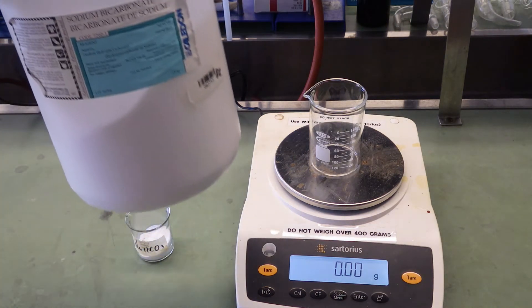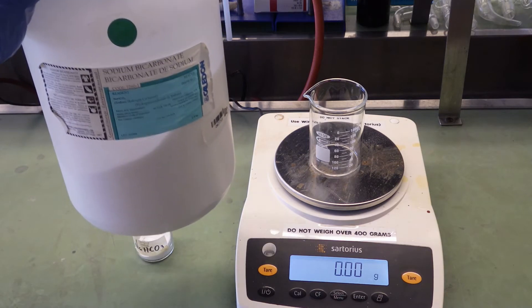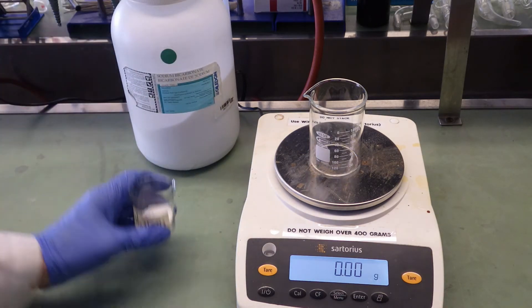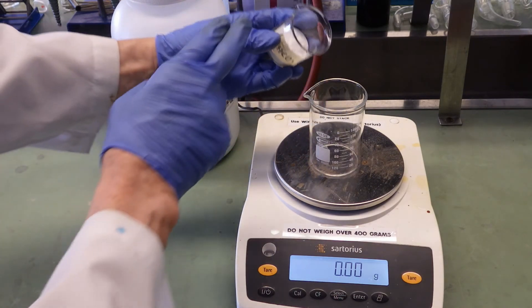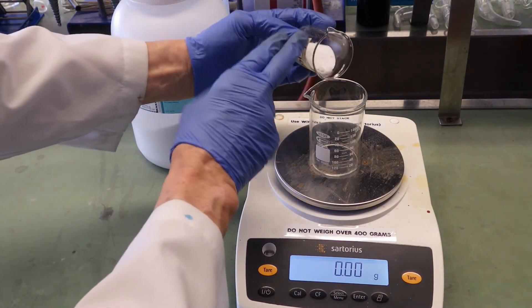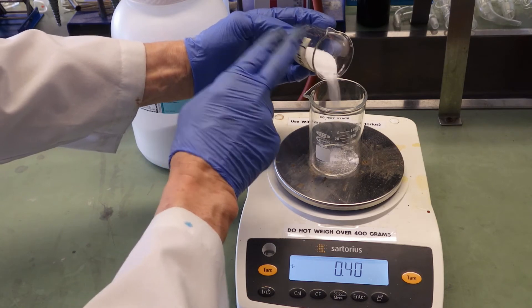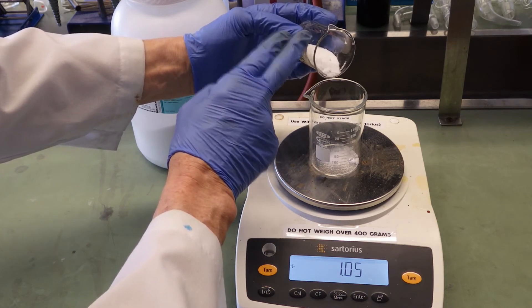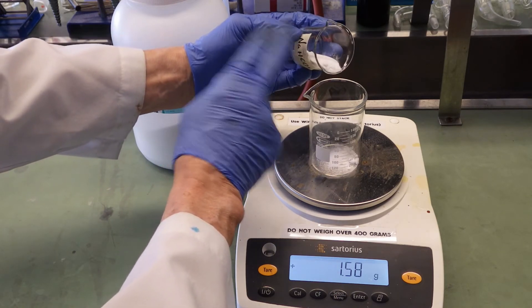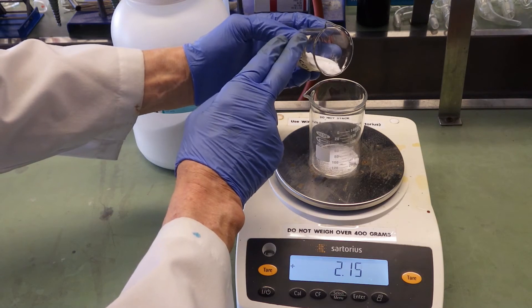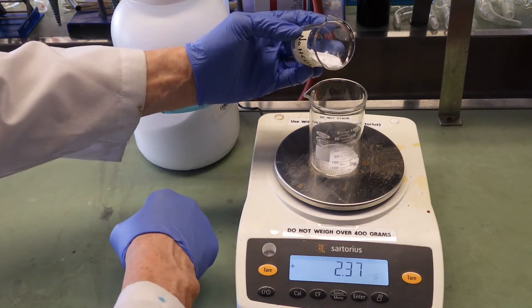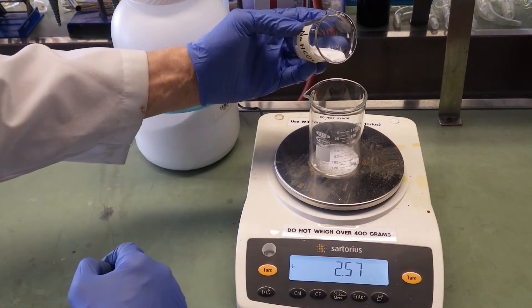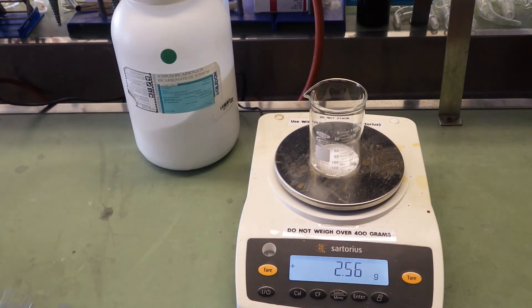I'm going to add sodium bicarbonate. 2 to 2.5 grams. You don't actually need a spatula for a powder. You can just tap it, as I'm doing here. You want to record the mass of sodium bicarbonate as well. That's 2.57 grams.